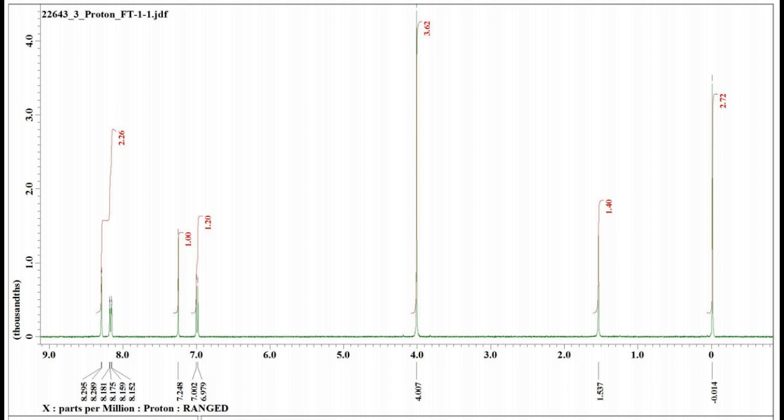The NMR and the IR spectrum of the product is also shown here. Thank you.